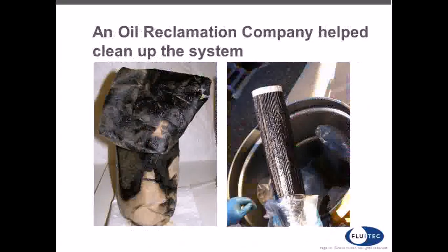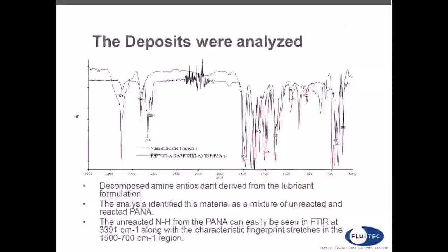So we split the deposit into a few different fractions and analyzed them to see if we could identify some of the different chemistries. The first thing we observed is that there was a strong signature in the infrared analysis that pointed to an amine antioxidant.